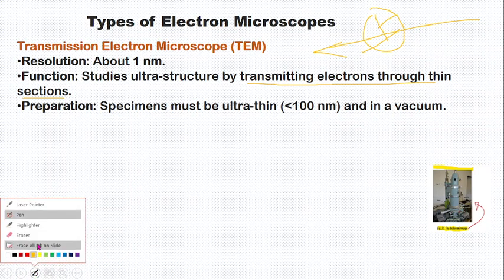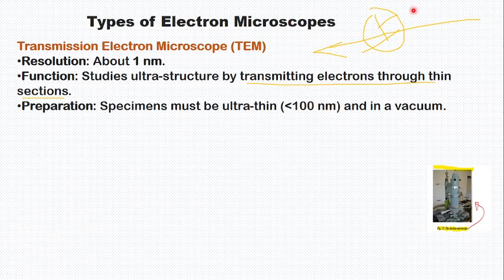Okay. So let's continue by understanding the preparation. A specimen must be prepared ultra thin, meaning very, very small, and in a vacuum, meaning there is nothing there. Okay, you should prepare this.